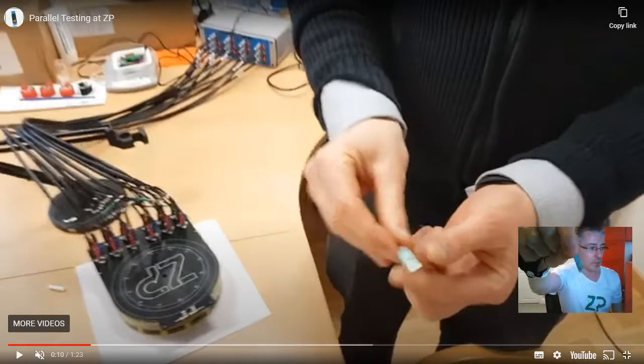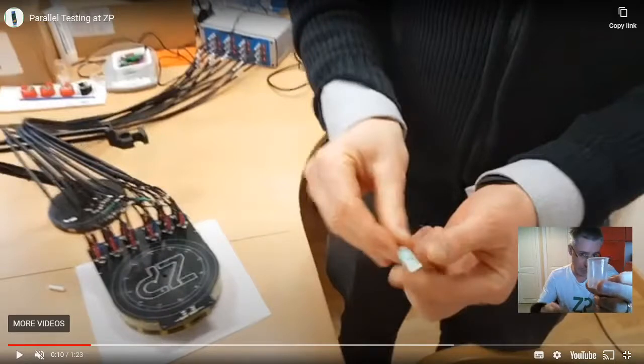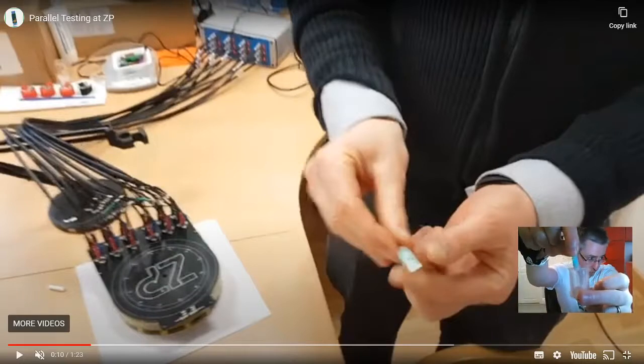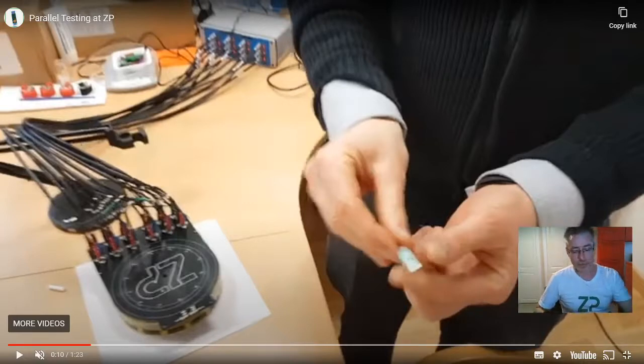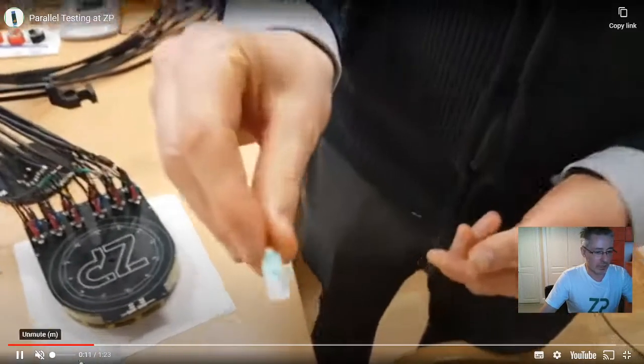In the video we show that all the electrodes are sitting in one solution, but you could imagine 3D printing a sort of tray with little individual beakers so you can test much smaller solutions. You don't have to have all the electrodes pointing down into one solution — you could have them in separate solutions.